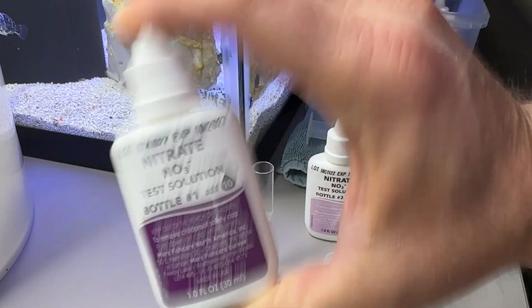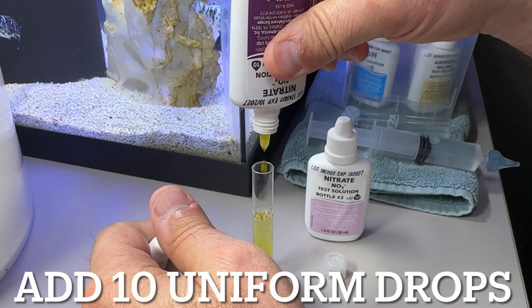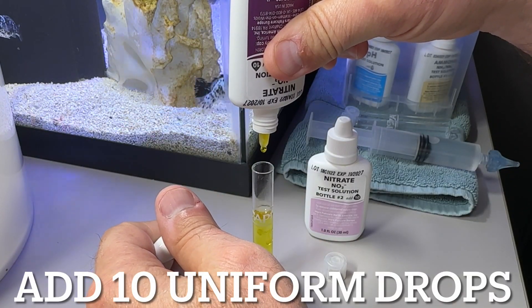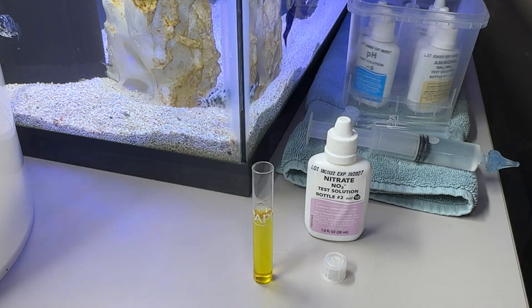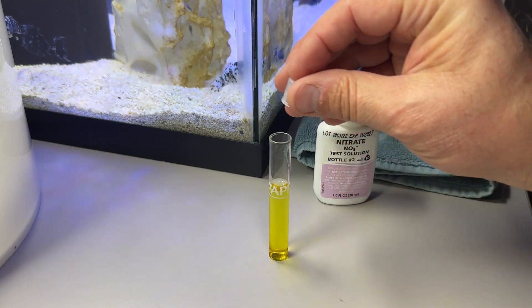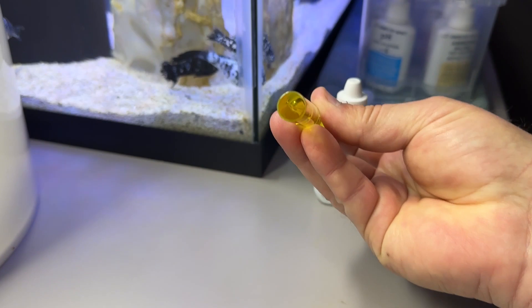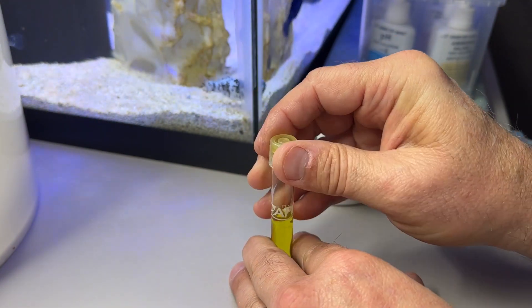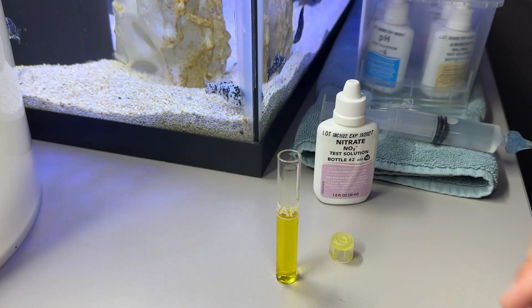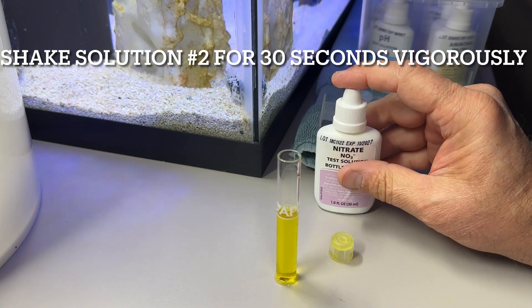One, two, three, four, five, six, seven, eight, nine, ten. Now we are going to cap the test tube and invert it several times to mix the solution.